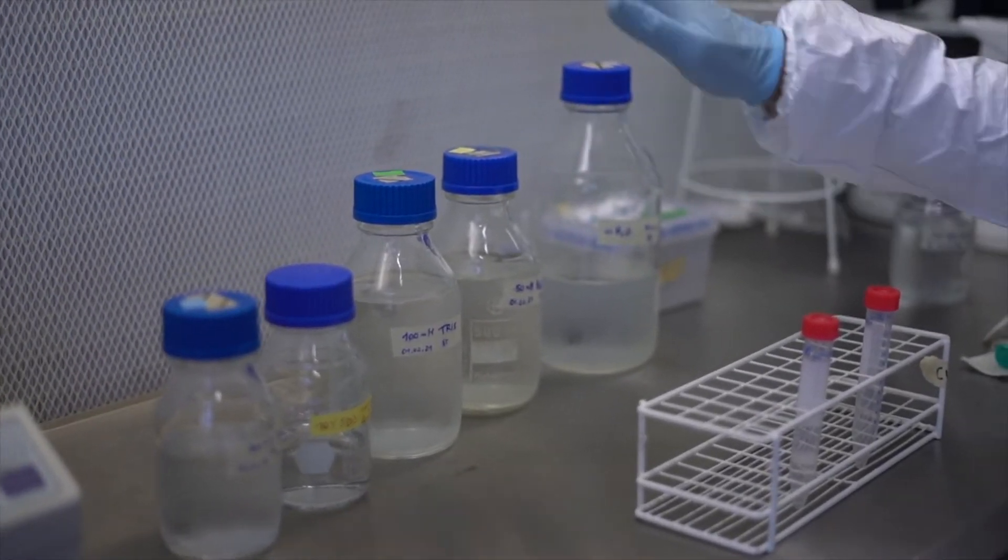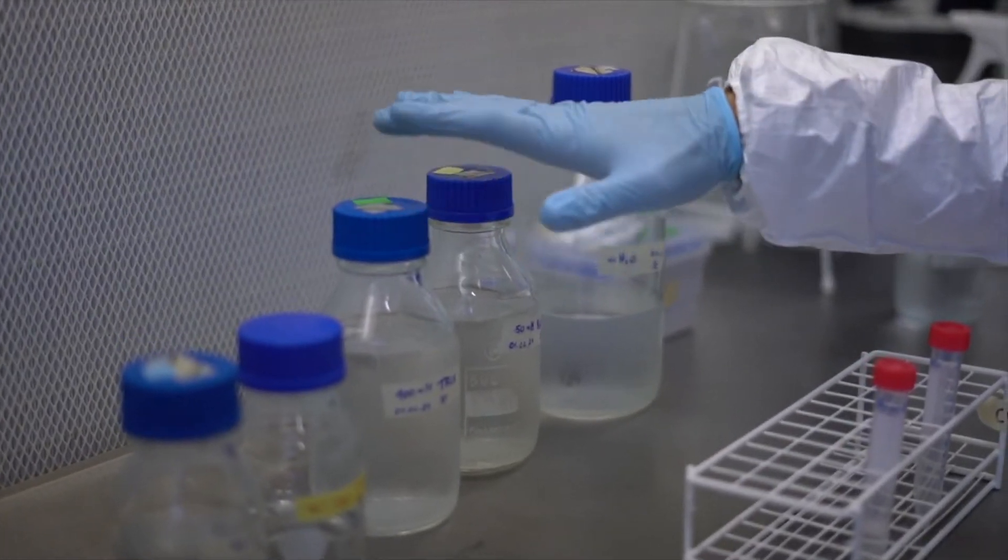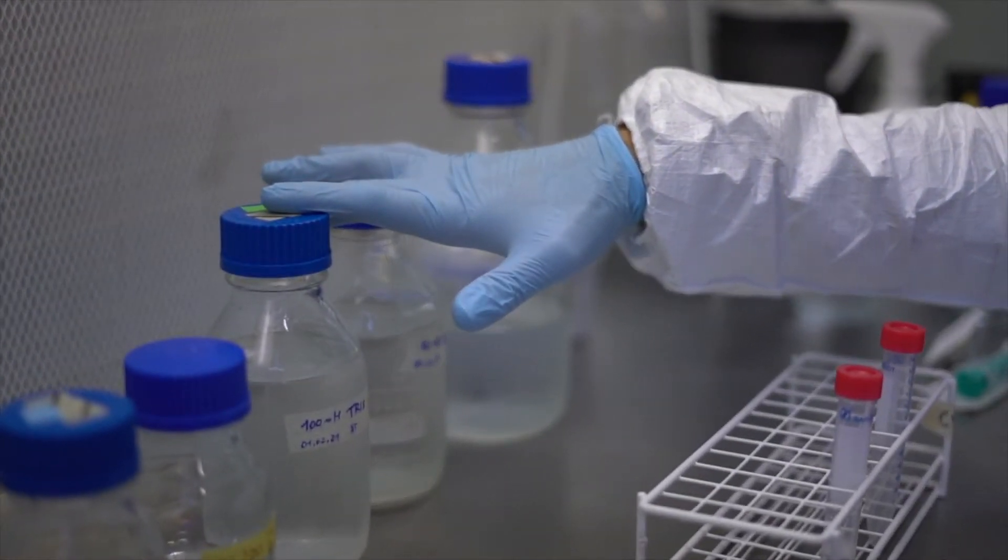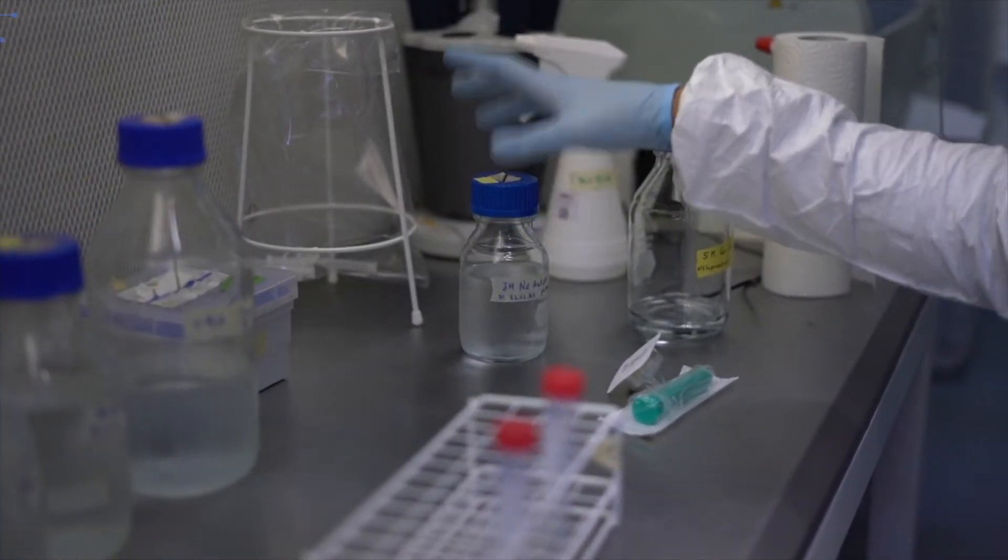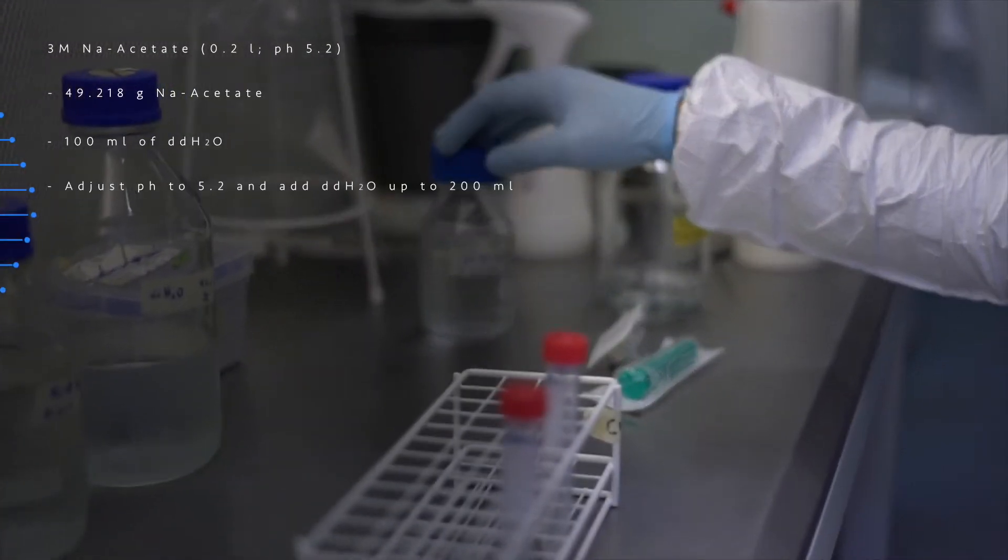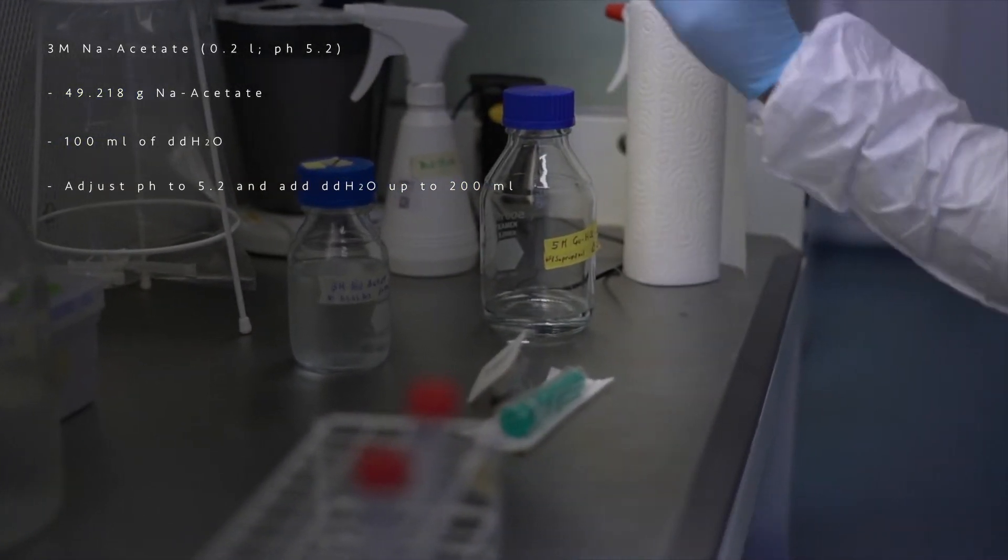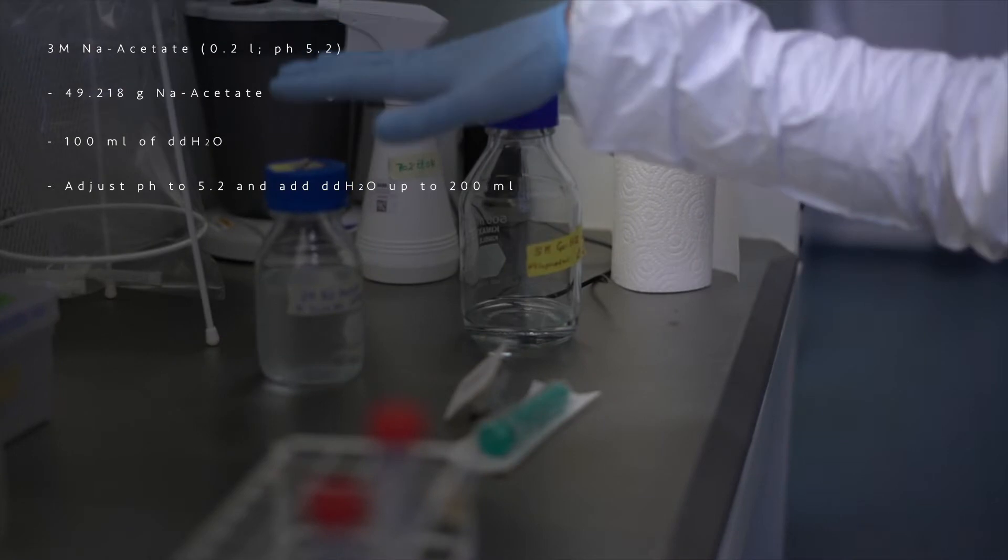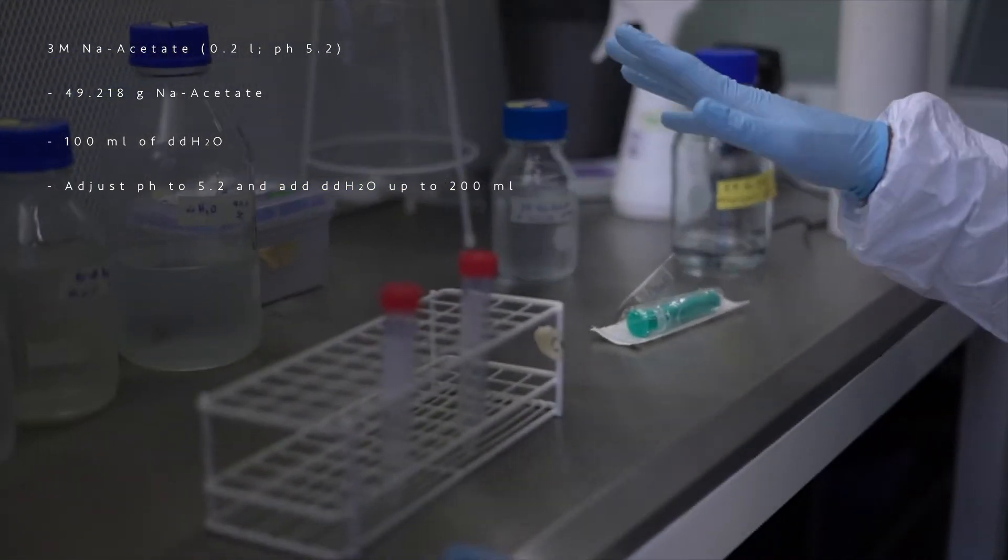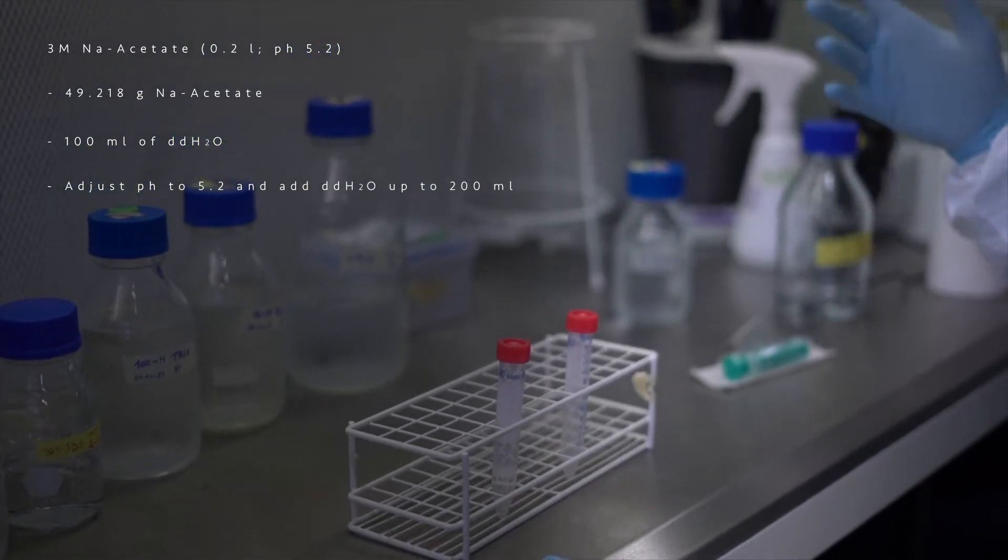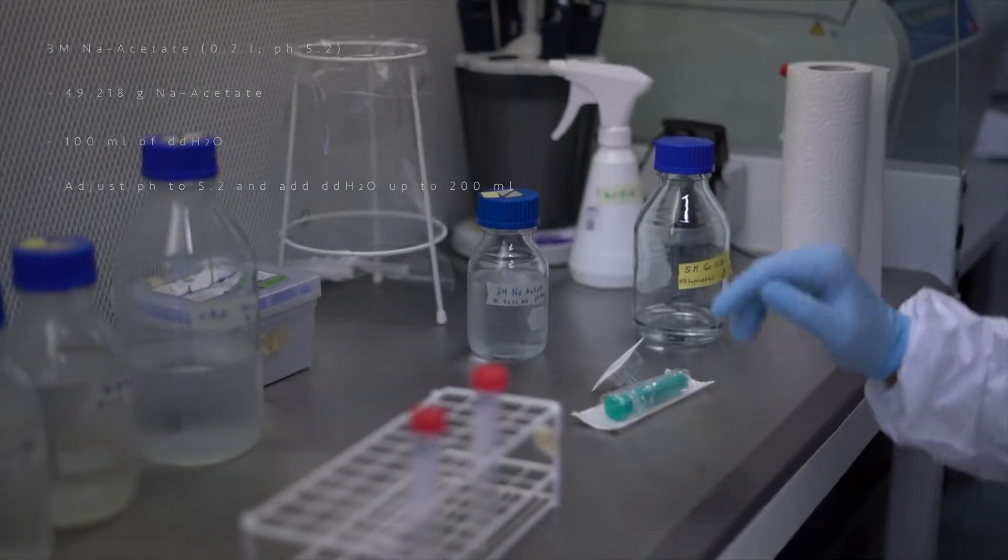We need to prepare beforehand three buffers: the PTB-DTT buffer which is the lysis buffer, we need to prepare it fresh right before starting with the extractions. Then we need two more buffers: sodium acetate buffer and guanidine hydrochloride 40% isopropanol buffer. Those two can be prepared in advance and stored in the fridge. Those we are going to use tomorrow during the continuation of the protocol.